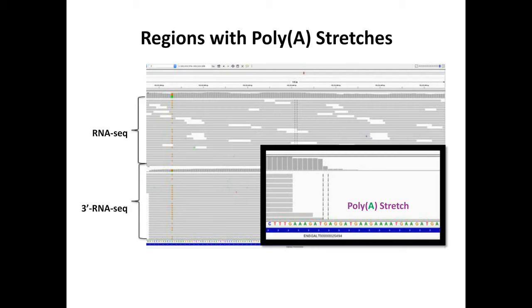So whenever we have this situation, the transcript downstream and upstream of that will end up in our cDNA library. So we have to come up with a parameter to delete all these reads because these are not real ends of the transcript.